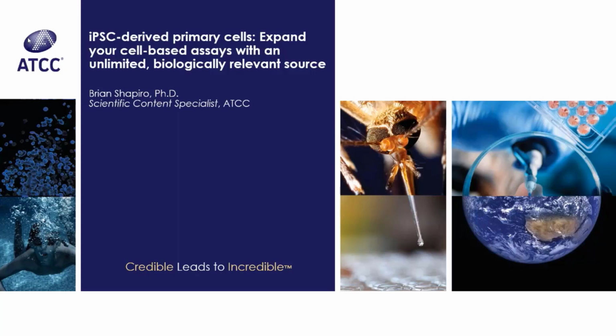He will then provide data demonstrating how differentiated iPSC-derived cells can be incorporated into immunoassays or further differentiated into other cell types, such as osteocytes, chondrocytes, and adipocytes.